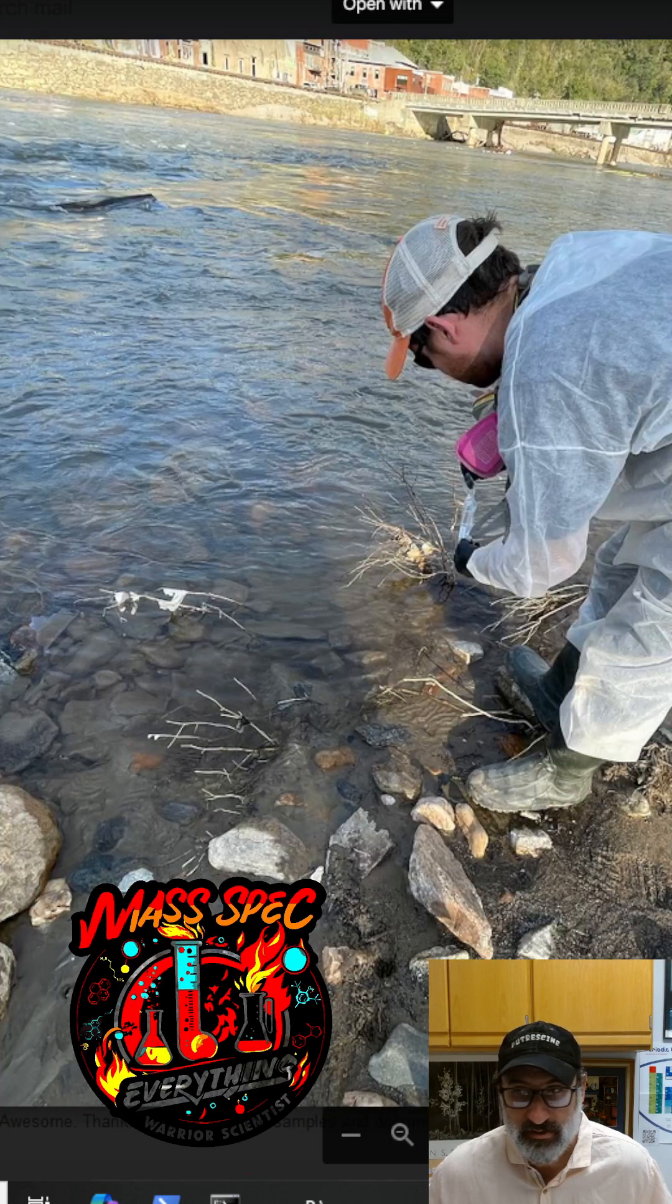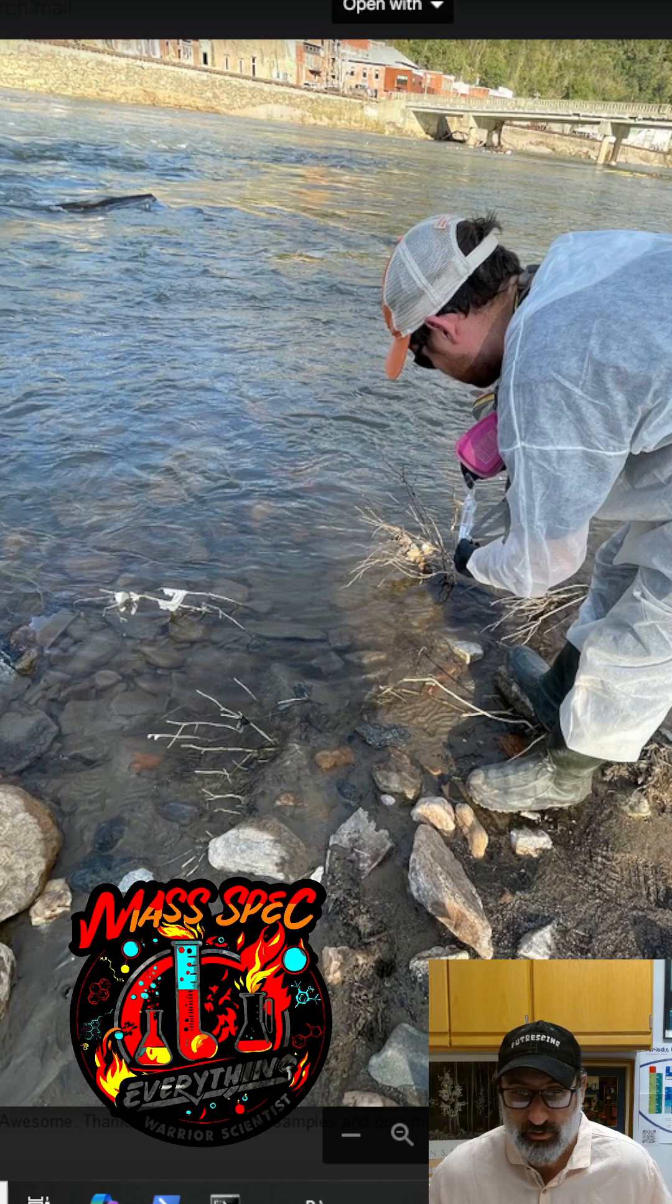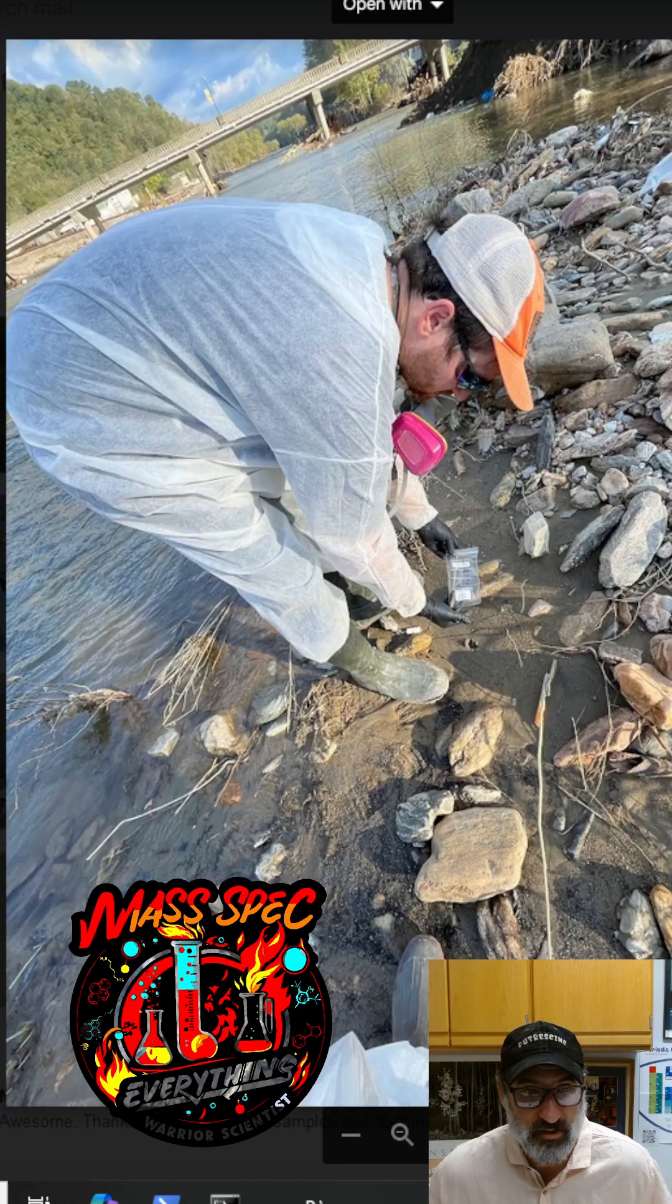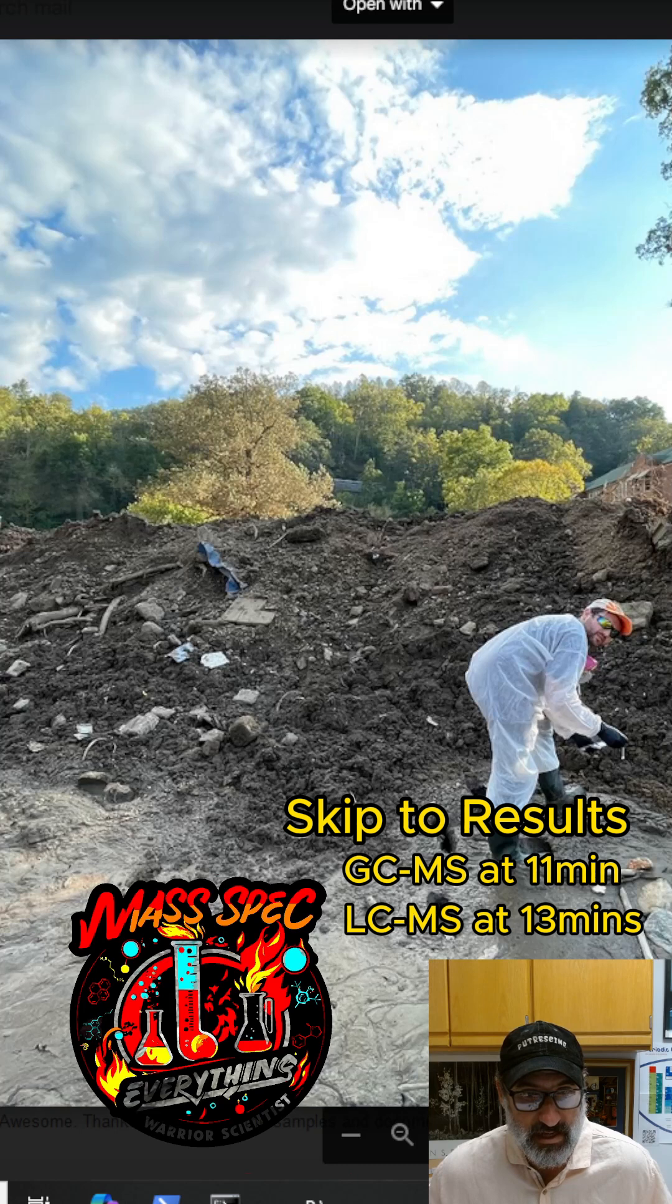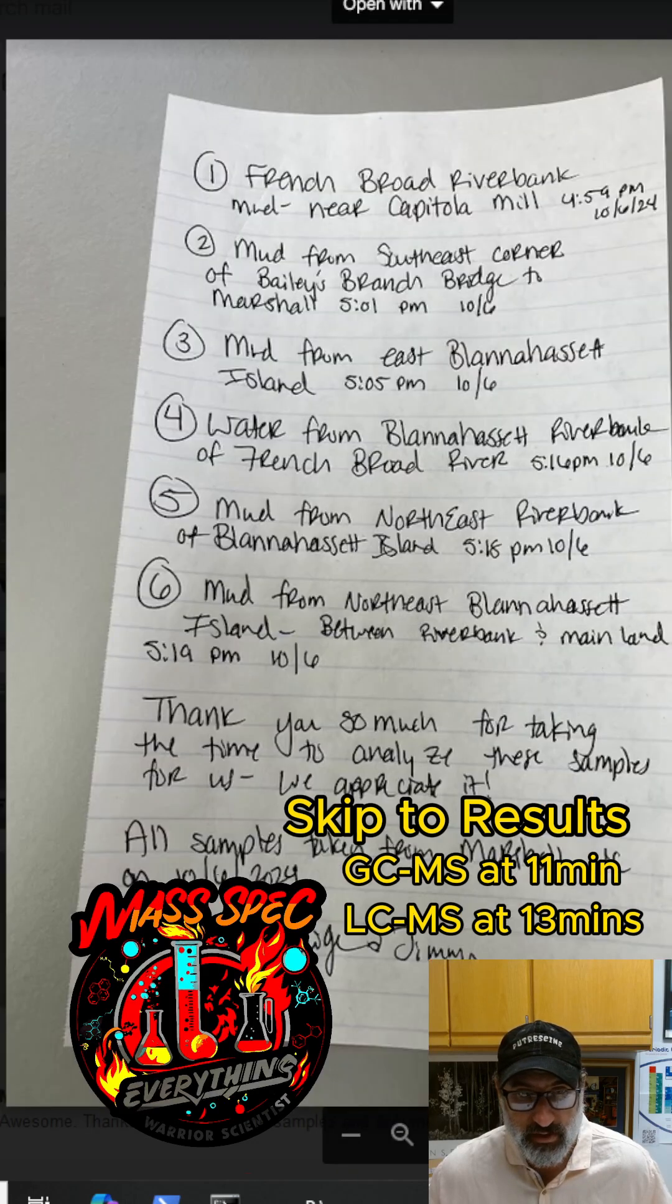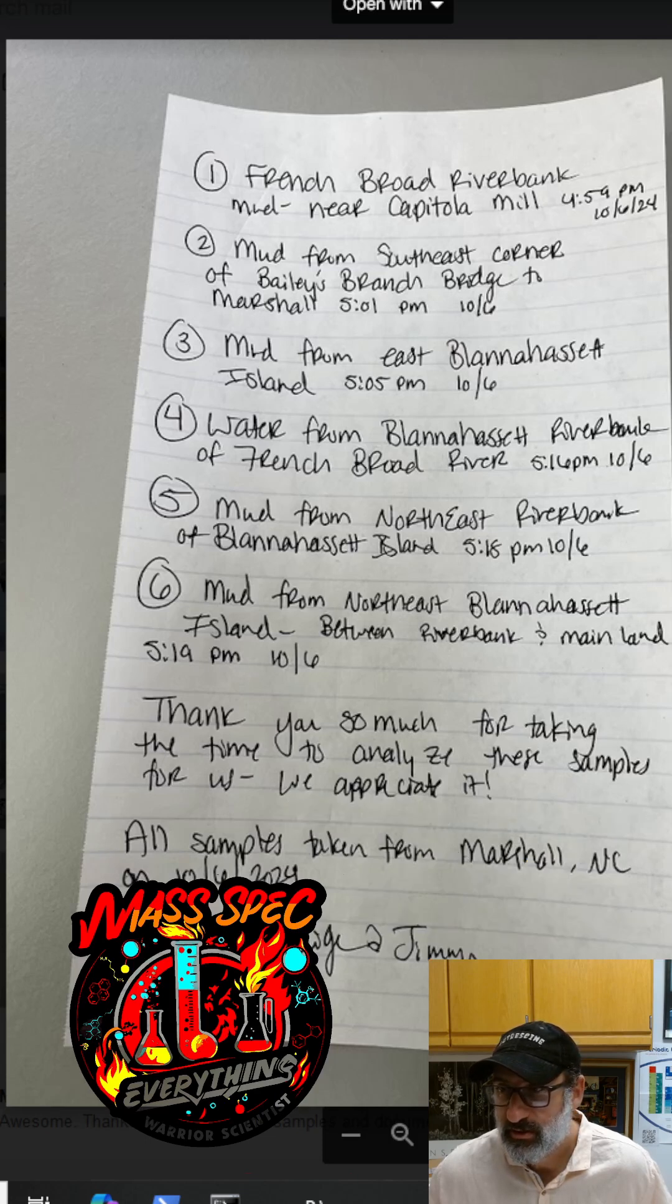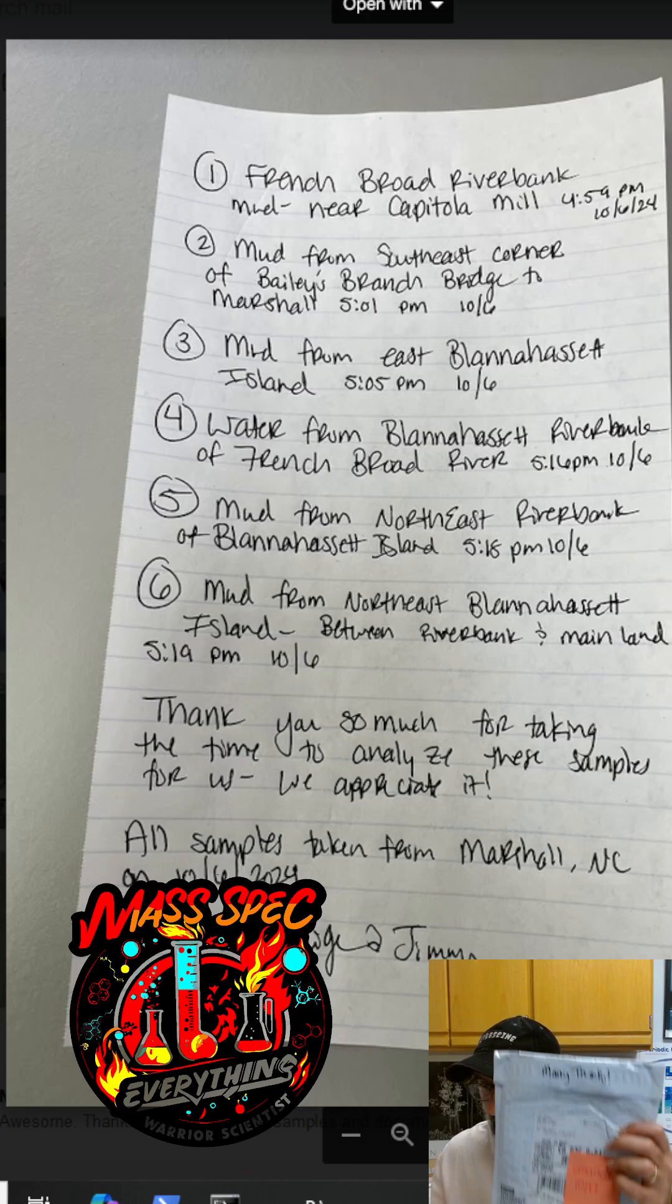We're going to do some research to figure out what's the best way to analyze mud samples. I've never been that good at environmental soil samples just because they're so complex. There's so many things there. But since we're not really looking at the soil itself, we're trying to look for contaminations in the soil. This is the legit North Carolina mud flood samples.